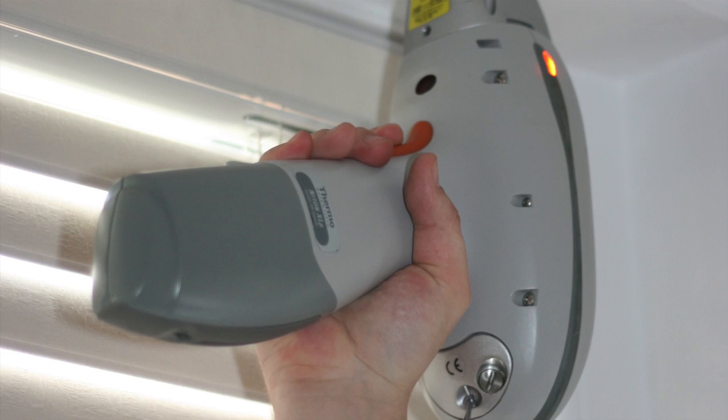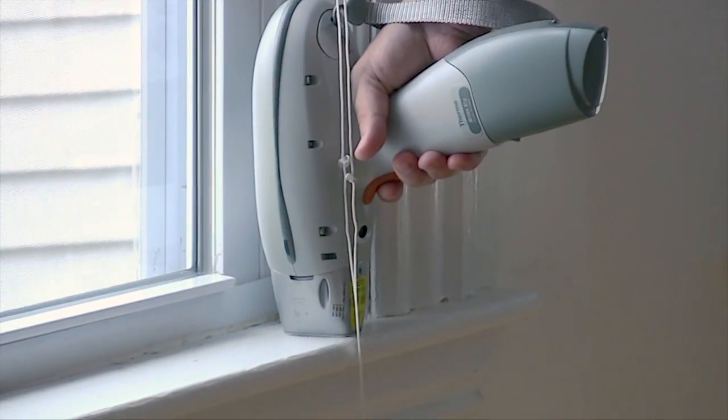Choose the Pioneer in Lead Paint Inspection: ThermoScientific Portable XRF Analyzers.